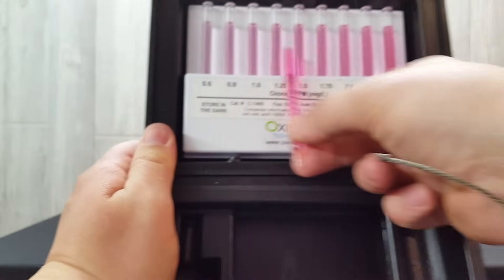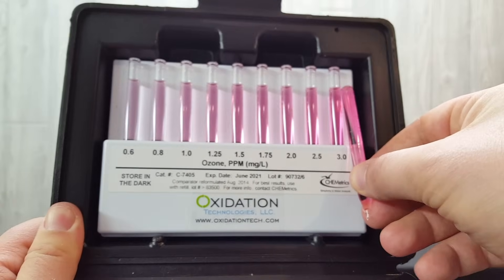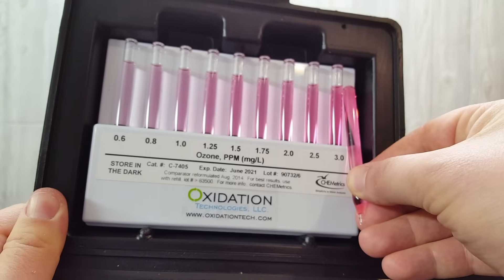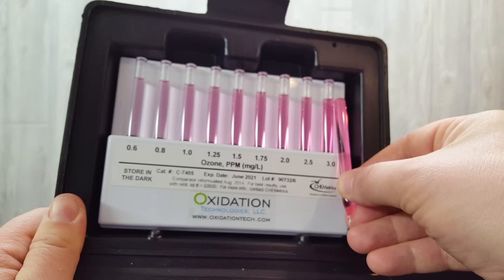When I compare it to the comparator, it's about equal to 3 parts per million. So you can multiply it by 2, and that gets you about 6 parts per million of dissolved ozone.